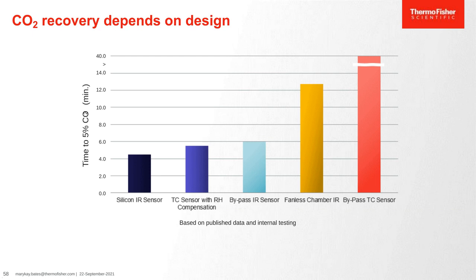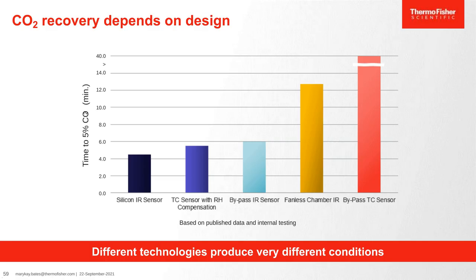And the CO2 recovery to the set conditions of 5%, the most commonly used concentration, varies very differently depending on the different technologies included in that incubator. And again, I'm not going to go through this table because I've done it elsewhere, but just to point out that even different sensors that are precision can work differently depending on the incubator design and what the airflow is like in that incubator.